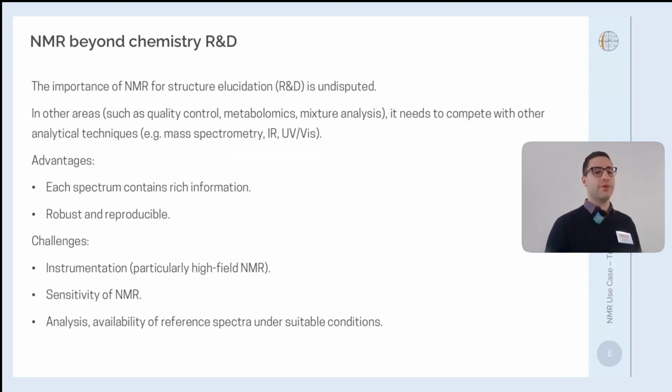And finally, especially if you go to benchtop devices, but also at high fields, analyzing samples, especially if you are working more in quality control in biology and you have samples that are mixtures of compounds, is anything but straightforward. This is actually something which you can address quite well with software, where you have to employ software and simulation techniques in order to get the most out of the instrumentation.